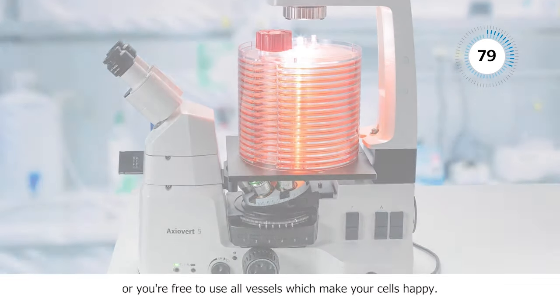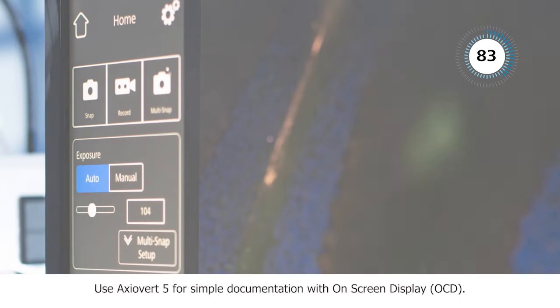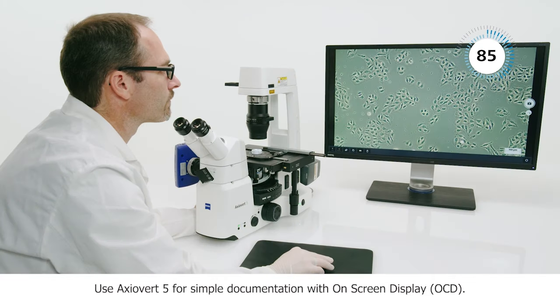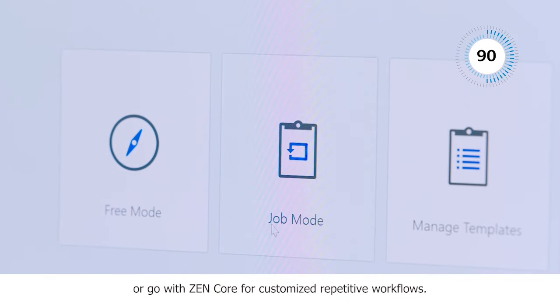Use Axiovert 5 for simple documentation with on-screen display, decide for Labscope for standard routine imaging, or go with ZEN Core for customized repetitive workflows.